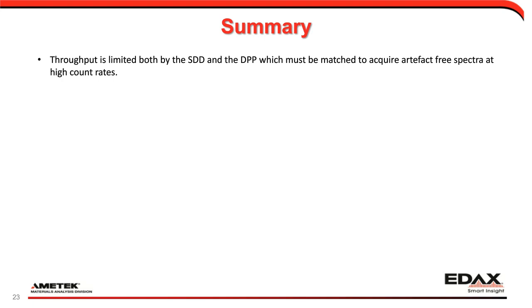Having high count rates coming into the system is not necessarily a good thing on its own. It's the throughput that matters. So you need to select the right processing time on the digital pulse processor to actually turn your input count rates into output count rates. I have seen people very happy that their systems can do 800,000 input counts until I point out that those are just input counts. You're only getting about 10,000 counts out of the detector because you're saturating it. So these things need to be balanced in order to make any sense.